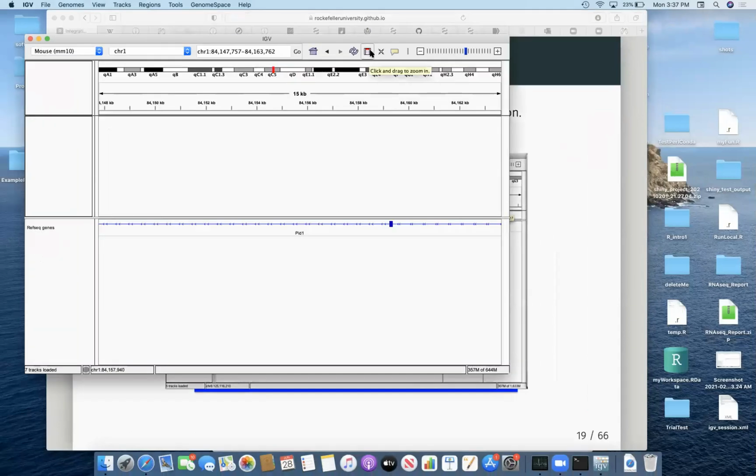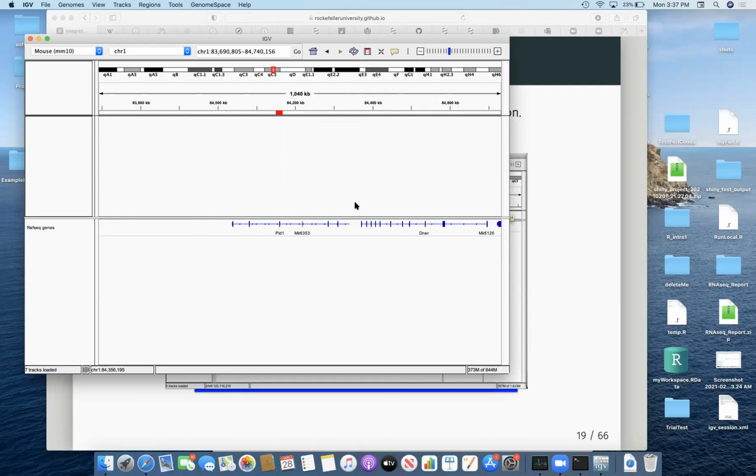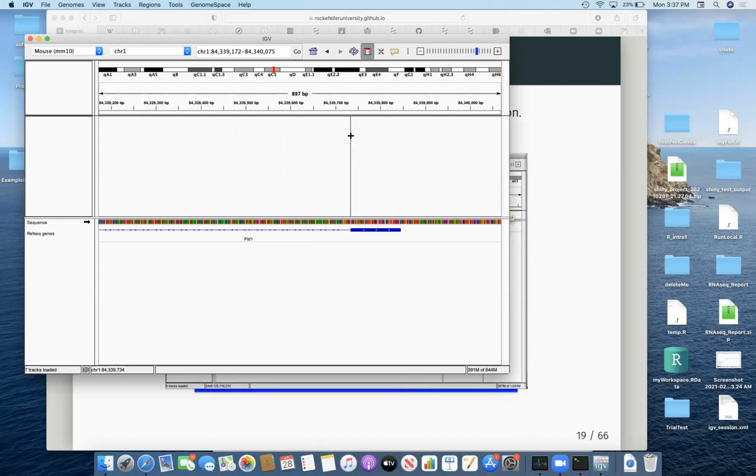Okay, I think both of these are things I will show you inside IGV itself. So the first way we do it, if I just click that and zoom out. Oh no, I have to do it like this. So that bookmarked my region here. Let's do that again. Let's say I want to bookmark the beginning of this gene. I'm going to zoom in over here. I can click here, define a region of interest, just from there to there. Now I've got my bookmarked region here.